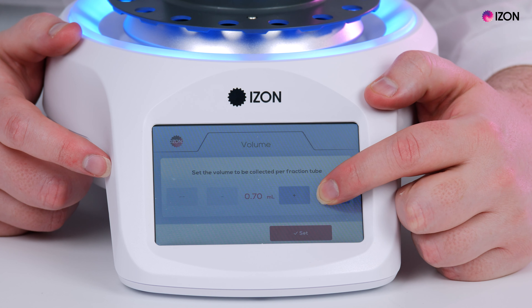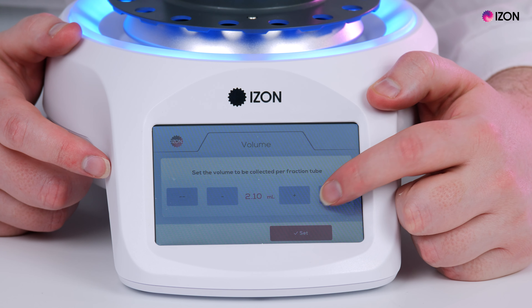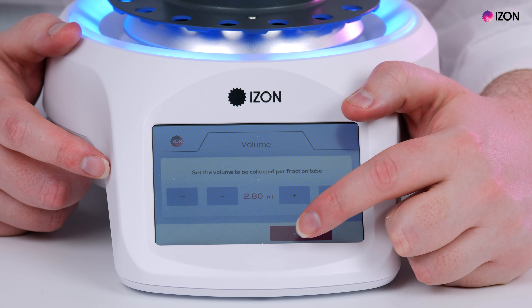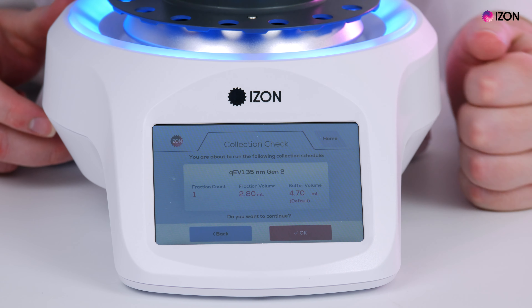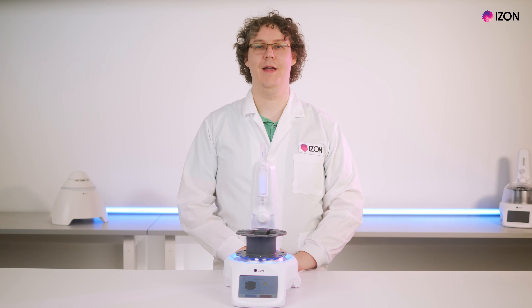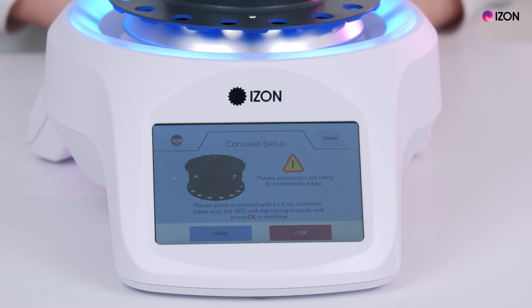I will change the collection settings to collect only one fraction of 2.8 mils, then click on start collection. Here you will be able to see that the AFC is recommending that I flip the AFC carousel to the 5 mil side. This therefore allows you to collect a full, purified collection volume in a single collection tube, saving time and potential loss of sample from pooling fractions manually after collection.